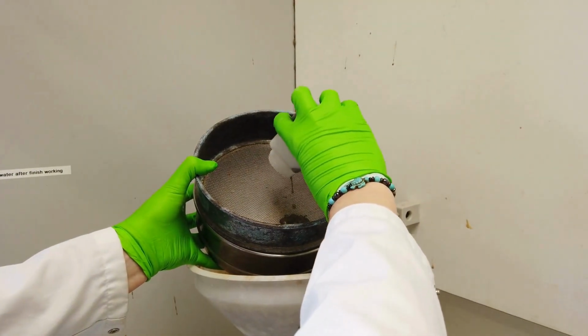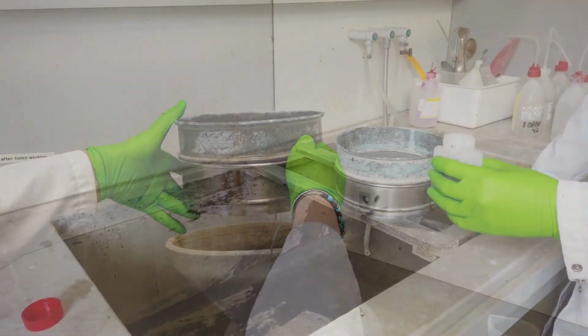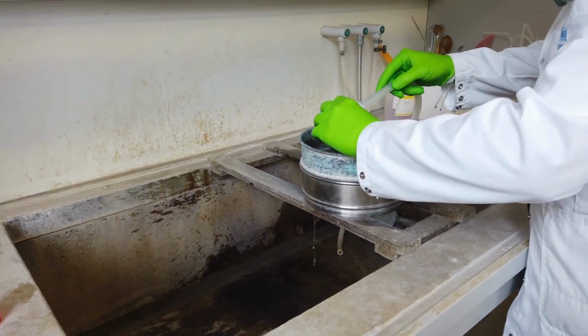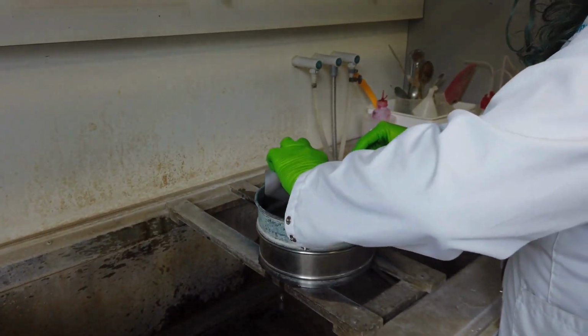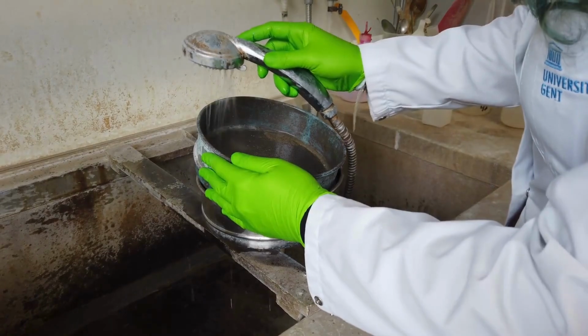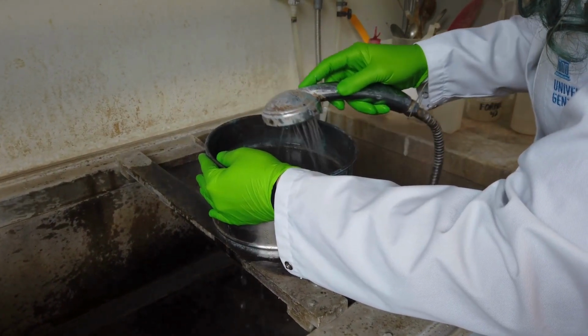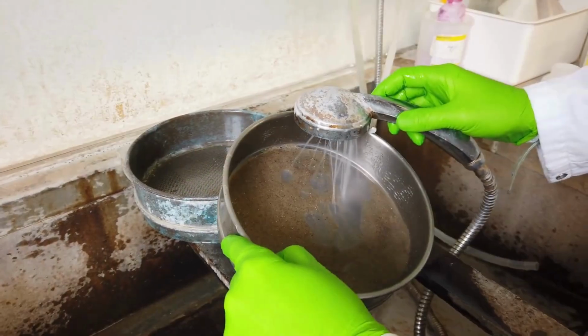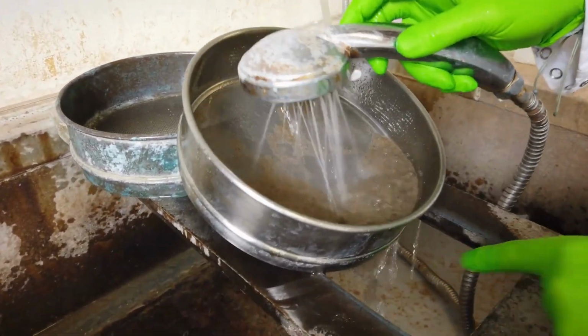The sample is initially poured over a waste container to remove most of the formaldehyde. The remaining sediment retained on the 38 micrometer and 1 mm sieves is rinsed with tap water under a fume hood to remove the residual formaldehyde and finer sediment particles. It is important to avoid splashing, with the risk of losing part of the sample, and continue washing until the water passing through the sieve is relatively clear.